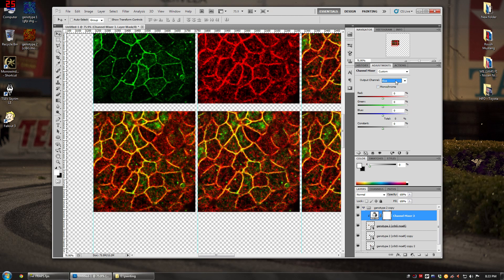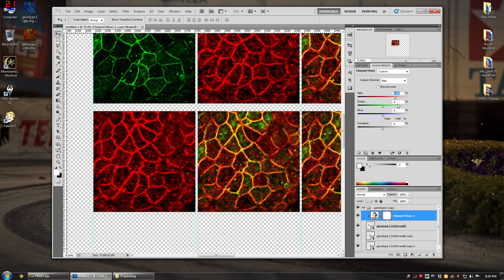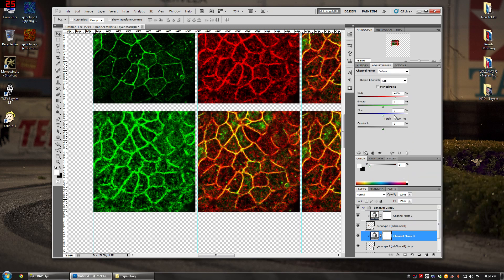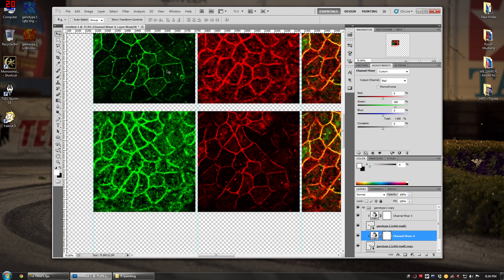To swap channels: go to the output of green, turn that to zero. Then for the red output, turn that to zero as well. Now go to the output of green and set the red input to 100 — so the red channel content is now being outputted as green. For the other layer, turn off blue, then go to the red output and set the green input to 100 so the green channel is outputted as red.